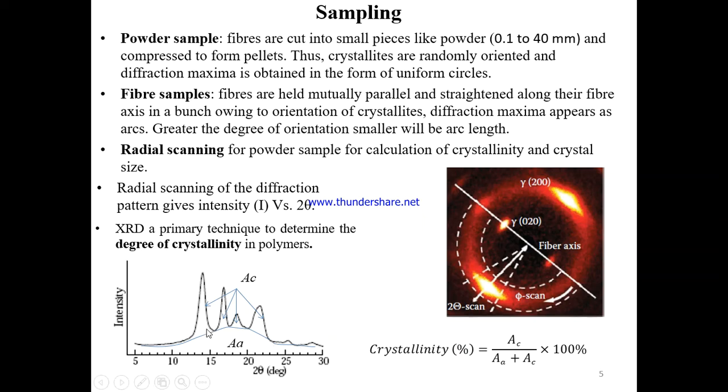Those intensity peaks represent the crystalline phase of the fiber.